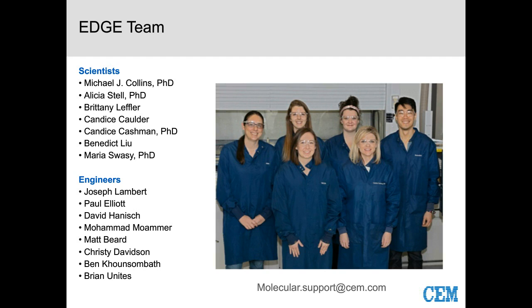So again, we have to move into those next stages of spiking and getting recoveries and really prove that we can do it. But right now, if I jump over to pesticides, we can run wet samples no problem and get really good recoveries for pesticides. So I think we might be able to develop a method here where we don't have to dry the samples. So you could run them wet.